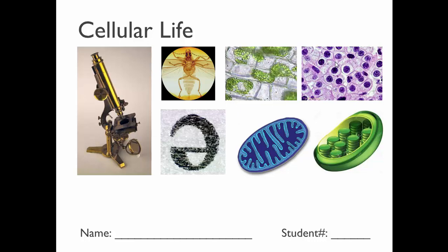So we are going to begin today by talking about the different types of microscopes. We'll just sort of give an overview about the parts of compound microscopes. And then this week we will get some practice using the compound and the dissecting microscope, and we'll work on a microscope lab. And then we'll start to move into cells once we understand how to use microscopes and so forth.